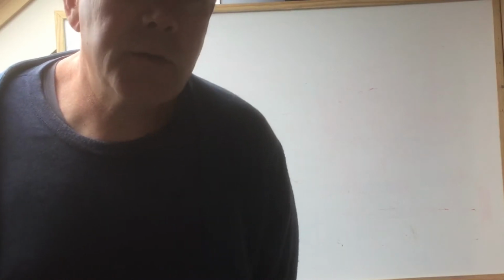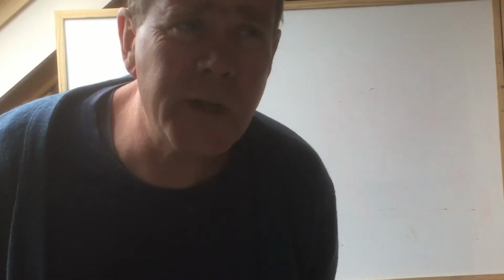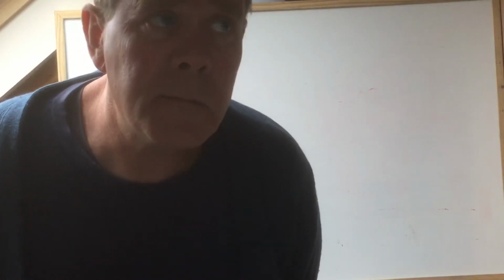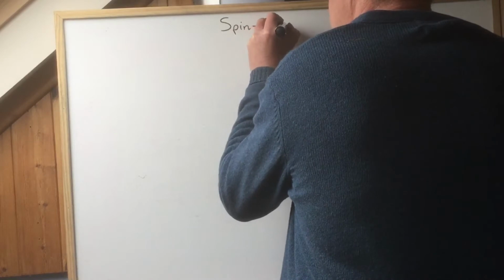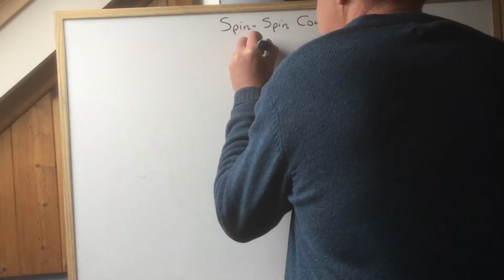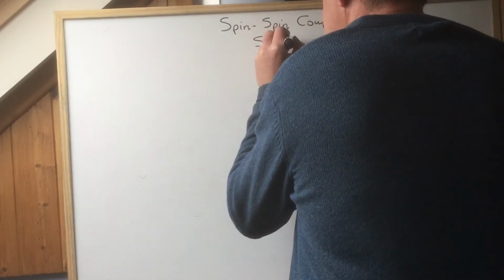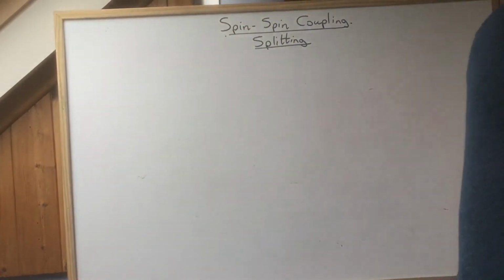So it'll take me a few more videos to sort that out, but without further ado, let's go to the last, trickiest part of the whole thing, which is splitting of peaks, spin-spin coupling, as it's actually called. Right, okay, let's go. Okay, so spin-spin coupling, or is this known as splitting?